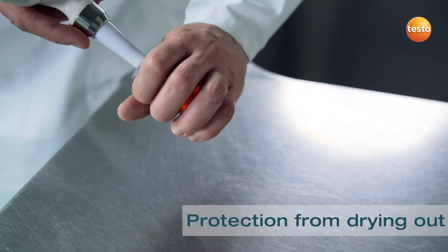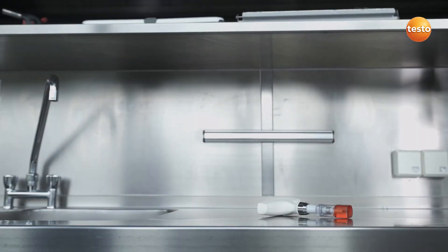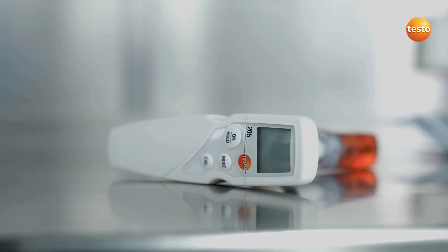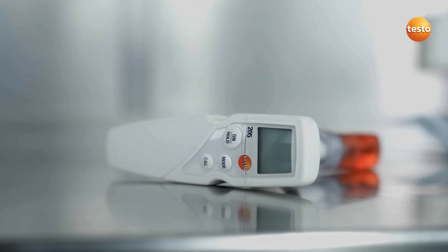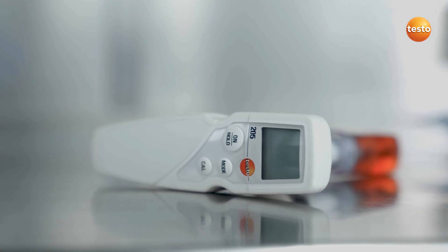The storage cap filled with KCL gel protects the pH probe from drying out. Find out more about the pH and temperature measuring instrument Testo 205 at your distributor or directly from Testo.